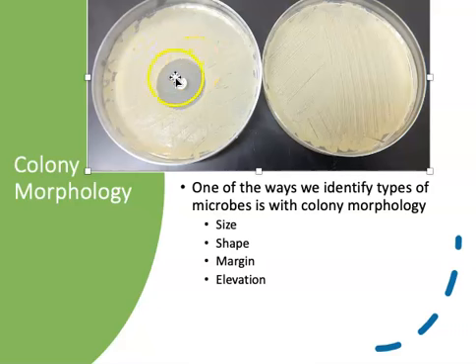They died because the antibiotic killed them. It basically diffuses into the agar, and the cells, if they are susceptible to it, will not survive. Now you'll notice that these cells did survive. They're still susceptible to this antibiotic. It's just that they were far enough away from the antibiotic disc that they were able to survive and grow.